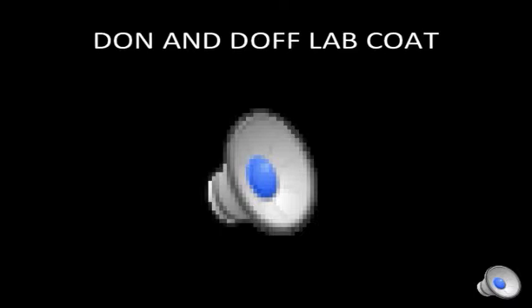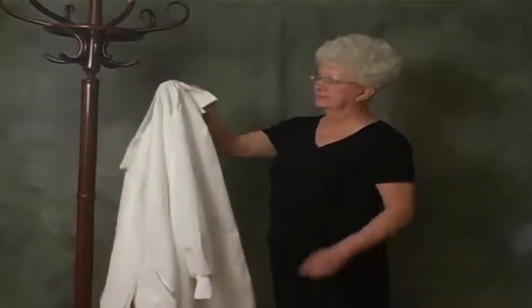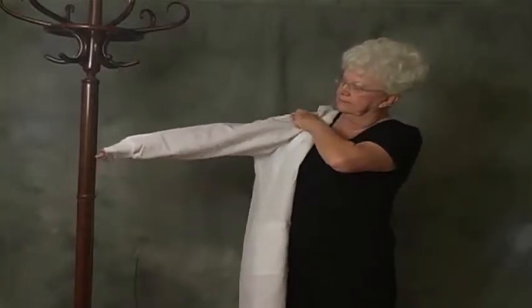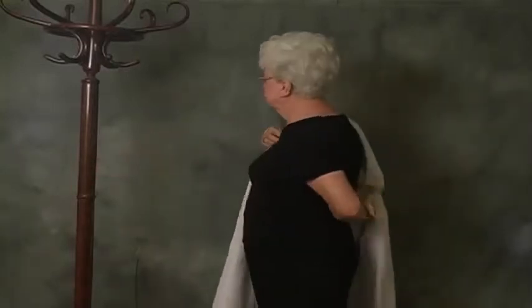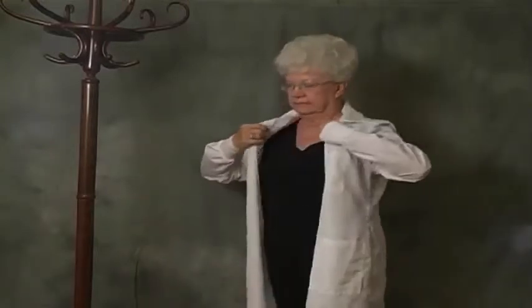The following video is an example of how to correctly don and doff a lab coat. The proper way to don or put on a lab coat is to remove it from its location. First, insert one arm into the sleeve. Next, insert the other arm into the other sleeve. Adjust the shoulders and the sleeves until they are comfortable. Then close the front of the coat.